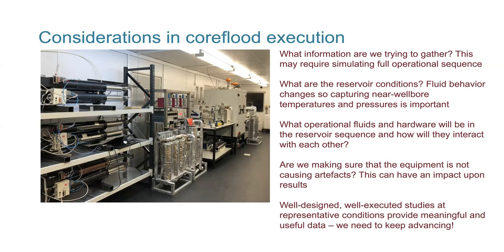It's something that the industry hasn't really talked about, is, what happens when I'm producing at a high rate. But we know from the research we've done that can have an impact on studies. So making sure you're getting as close to the reservoir conditions as possible, using the right fluids in the sequence, and not having artifacts caused by the equipment. And that can mean doubling the size of them, investing huge amounts of money. Unfortunate thing for someone who wants to start a formation damage lab is it's an expensive hobby to have, is to buy the kind of pumps you use for this test. This is for injection.